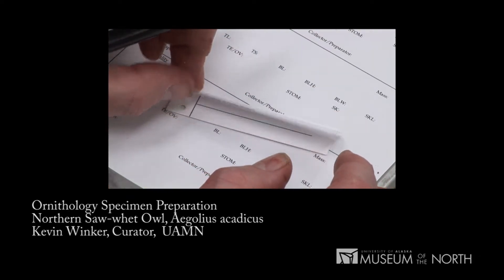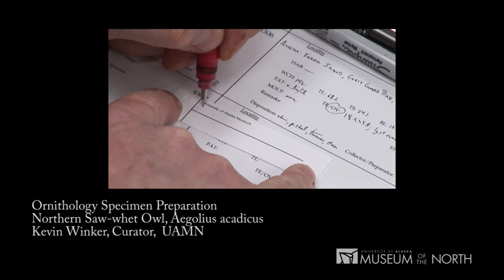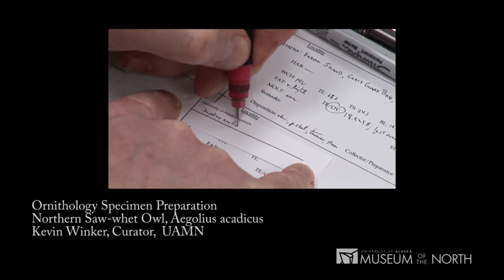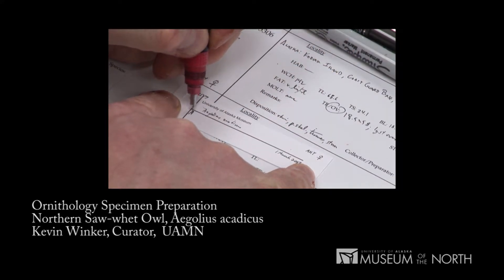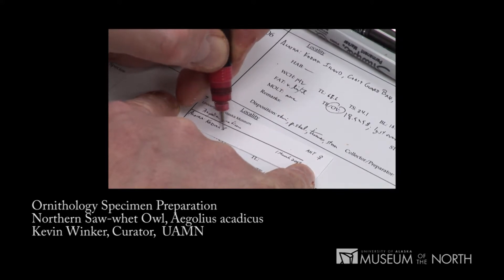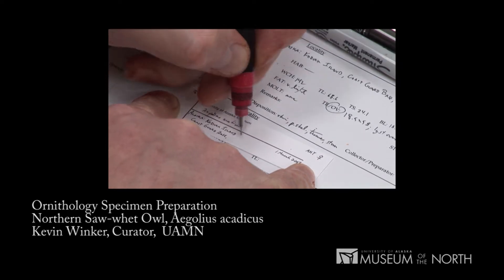Specimen labels are written — one for the skin and one for the skeleton — by putting the same information onto this label format. The species is Aegolius acadicus. It's an adult female. It was taken on the 1st of March, found on the 1st of March 2006. It was found in Alaska, on Kodiak Island, Coast Guard Base, Rezanov Road.